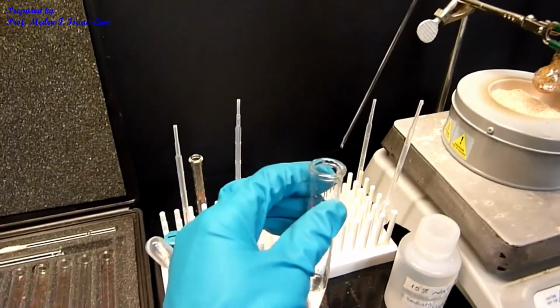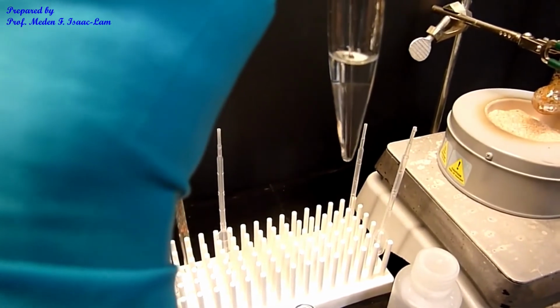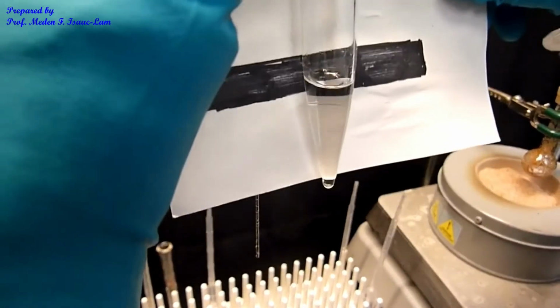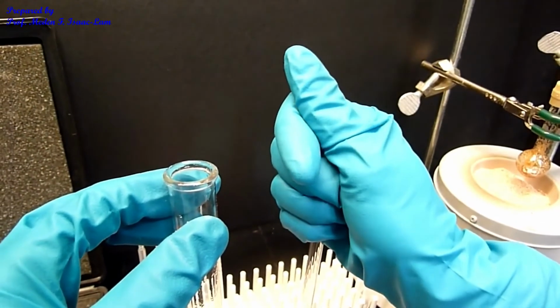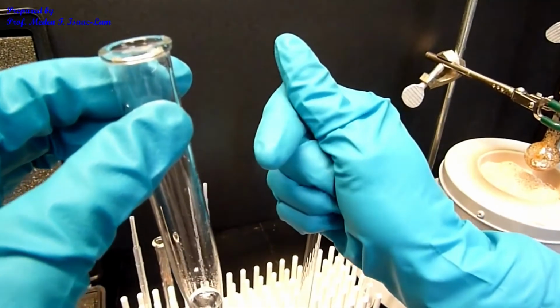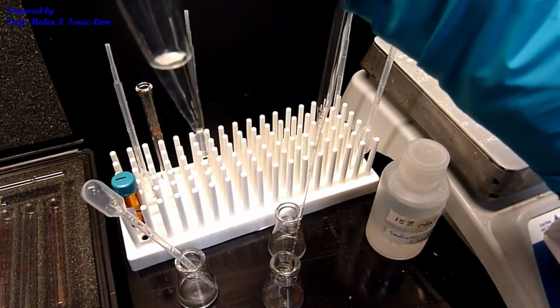So I'm getting rid of the lower layer, which is actually just the brine solution. So you can see that there is a layer. If you look, there's a layer. So I'm getting rid of the lower layer. If there are a few droplets of water, we can get rid of it. We don't want water because it will interfere with the IR that we're going to be doing.